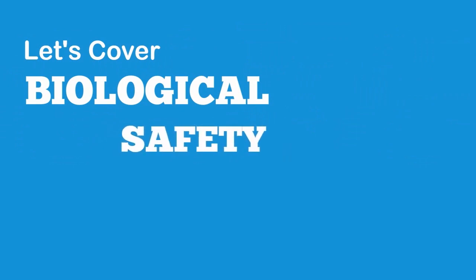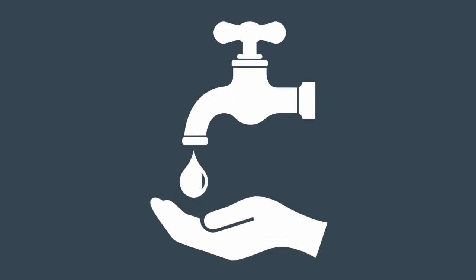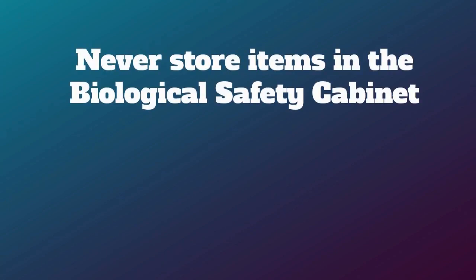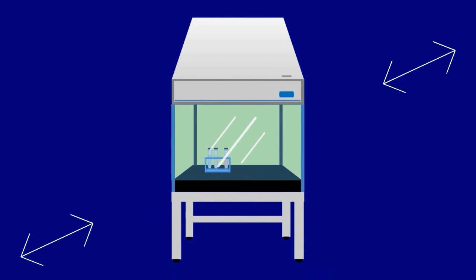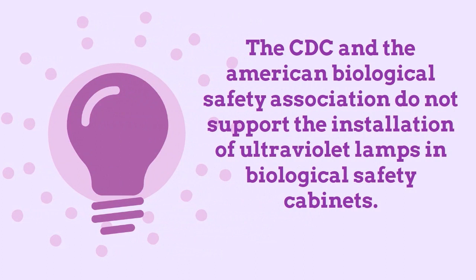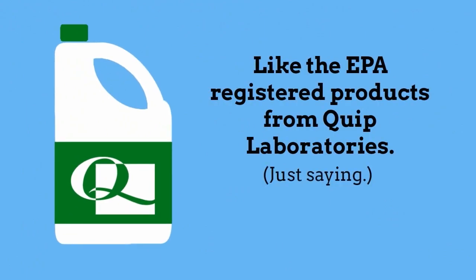Lastly, we need to cover biological safety cabinets. No matter what kind of biological materials you're handling, you should always remember to wash your hands completely with an iodine hand soap before and after using a biological safety cabinet. Make sure you never store items in the cabinet, such as pipettes and gloves, and don't forget to disinfect all work surfaces before and after using the BSC, as well as disinfect all items that go into and come out of it. It's also worth mentioning that although they've shown to be effective in limited capacities, the CDC and the American Biological Safety Association do not support the installation of ultraviolet lamps in biological safety cabinets, as these lamps can provide a false sense of security since they are not registered by the EPA and cannot guarantee their efficacy in the same way as a chemical disinfectant.